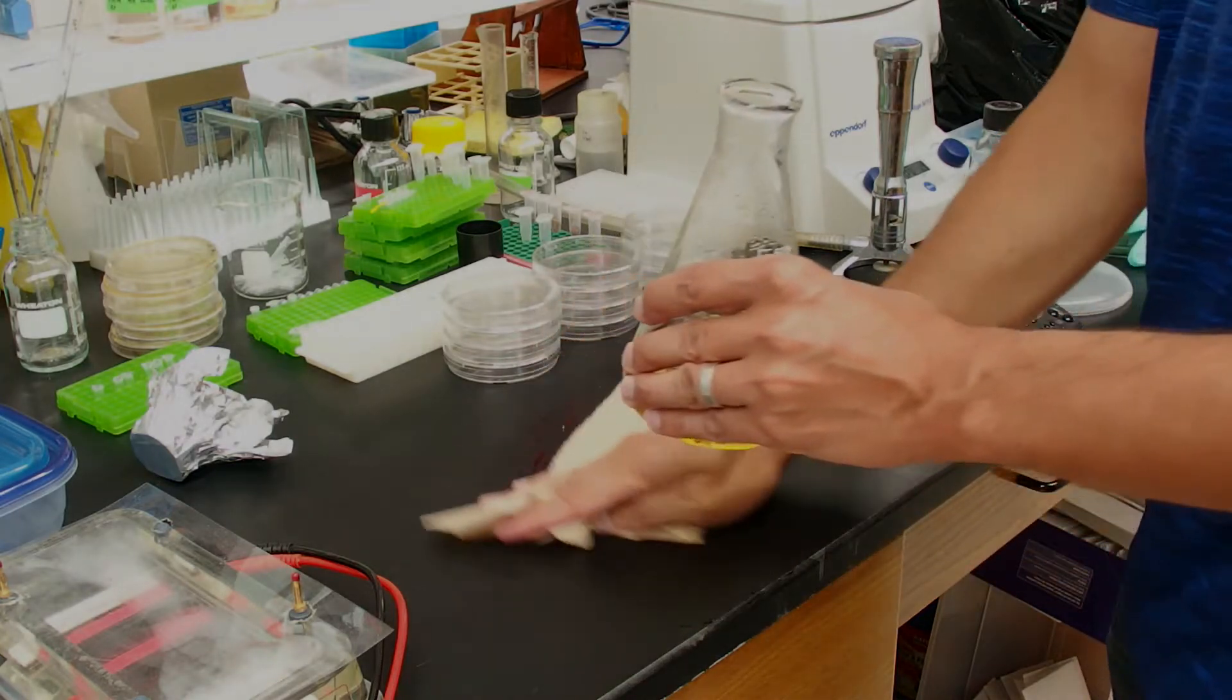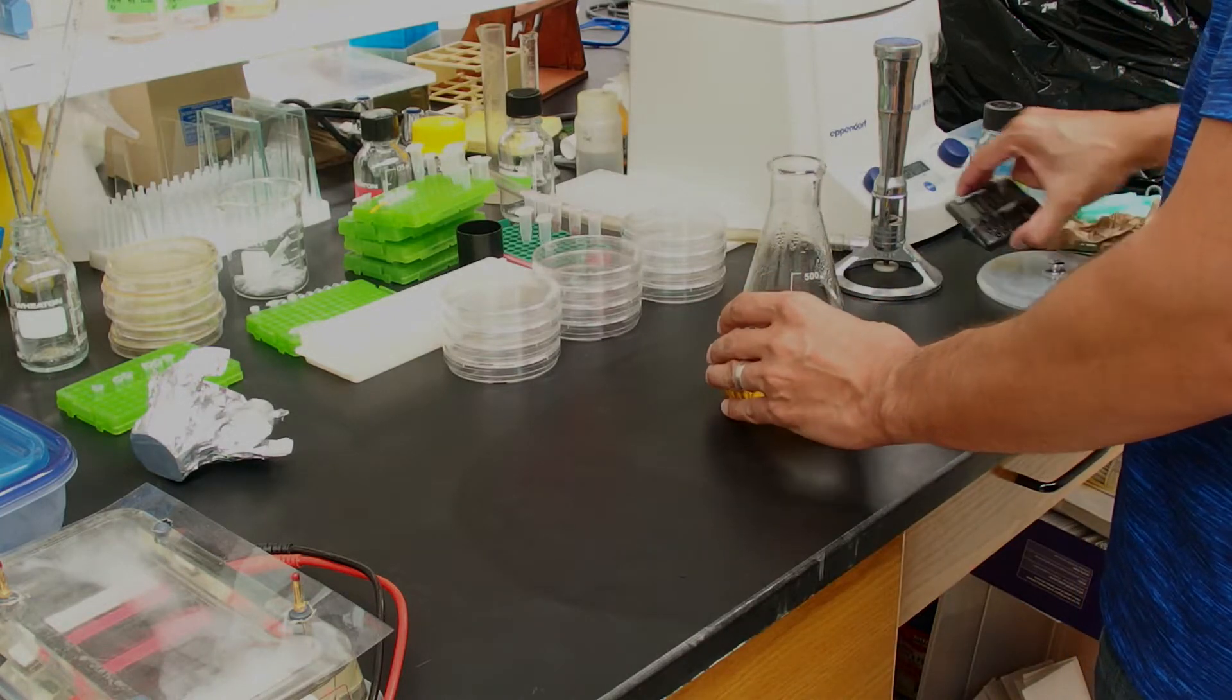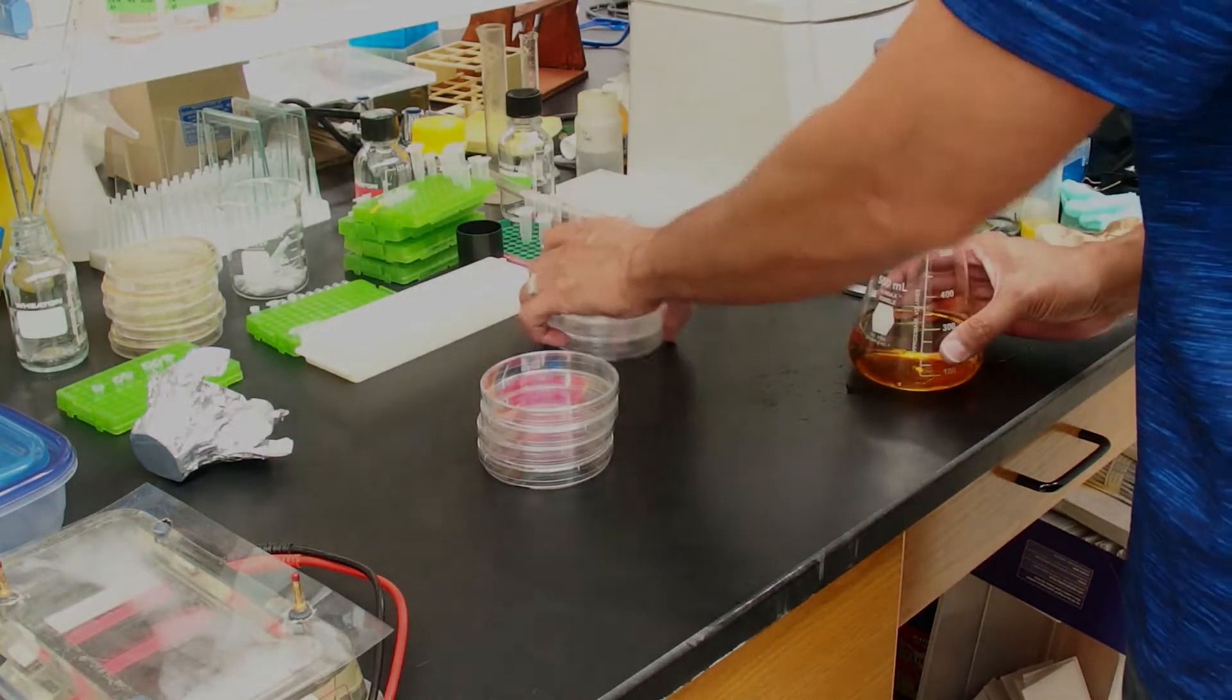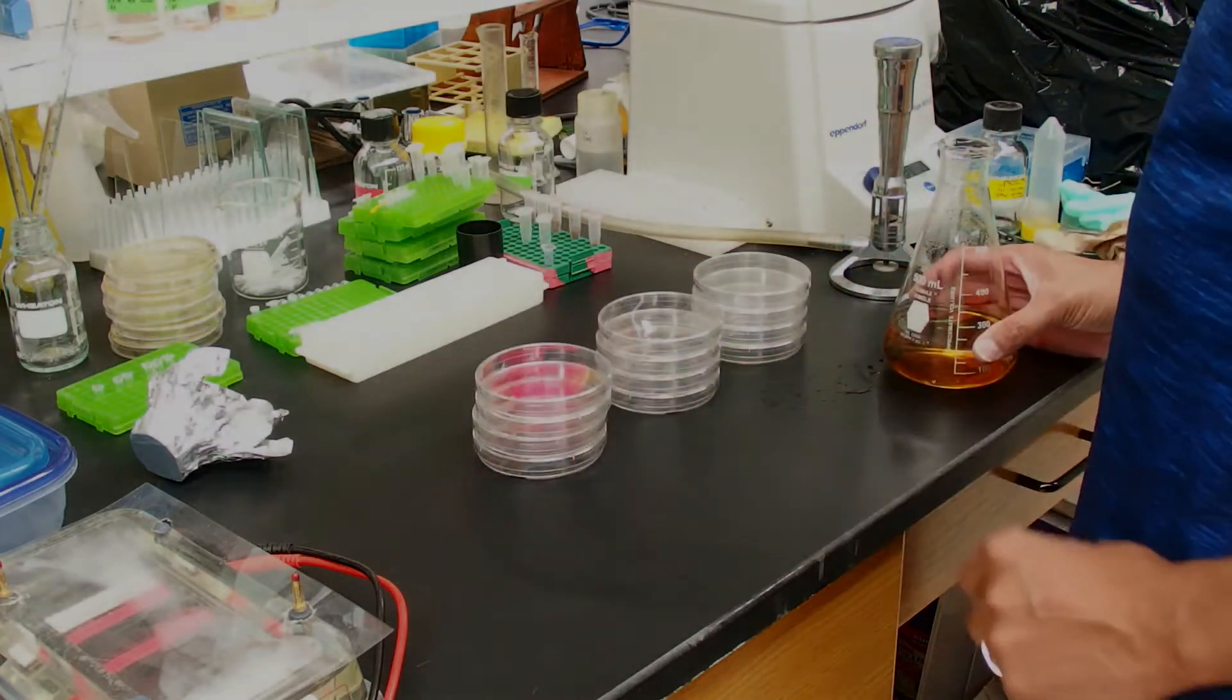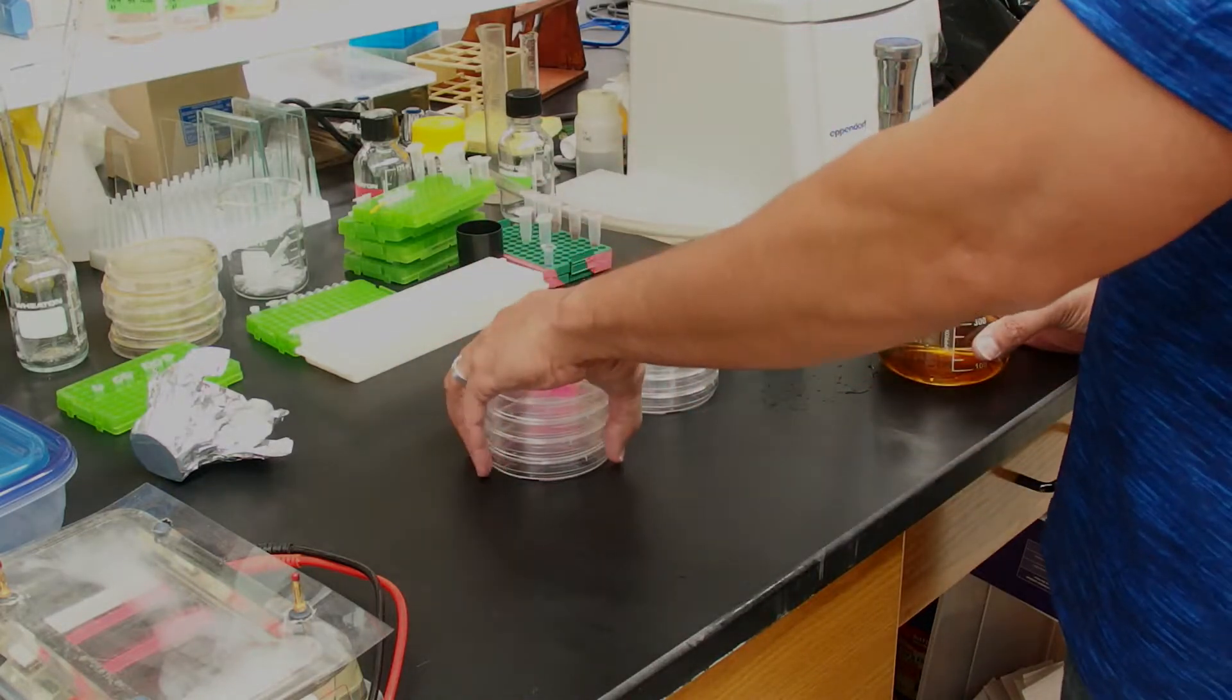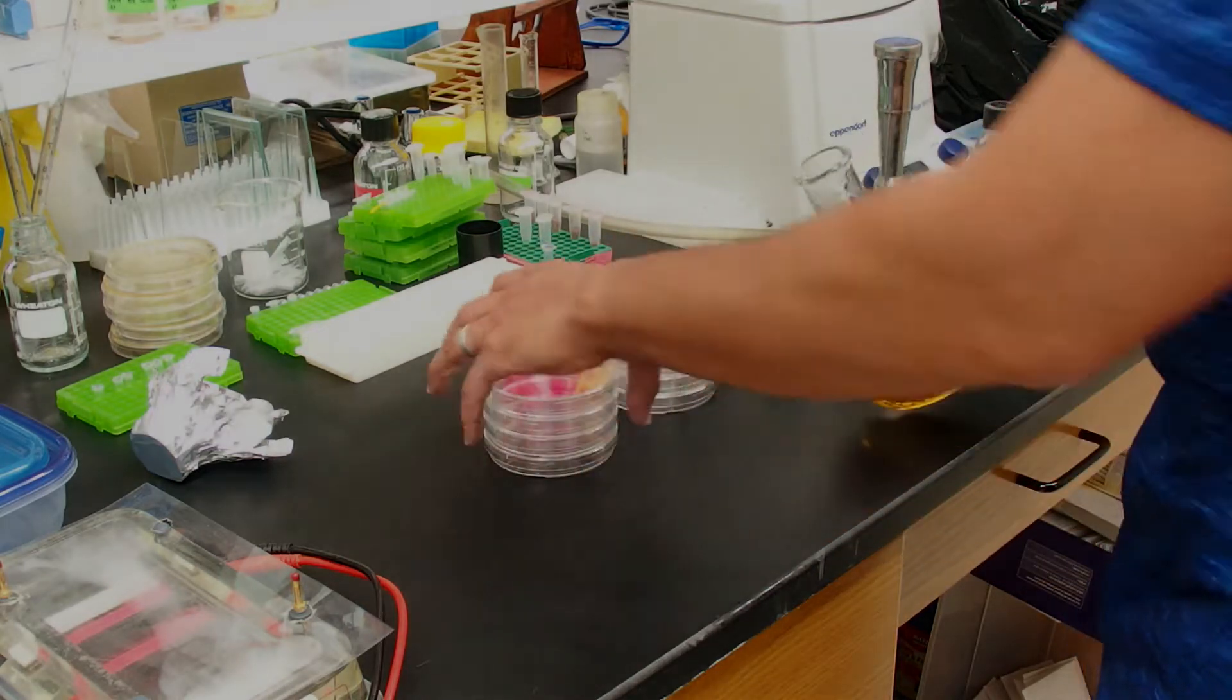You need approximately 20 milliliters of LB agar per plate. I usually pour my plates just a little bit less than 20 ml. So I'm going to try to get 12 plates here. What you want to do is you want to stack up your plates three or four high in nice, neat stacks. And the technique that we're going to do is we're going to lift and pour, and then lift and pour the next one. Let's go ahead and do that.